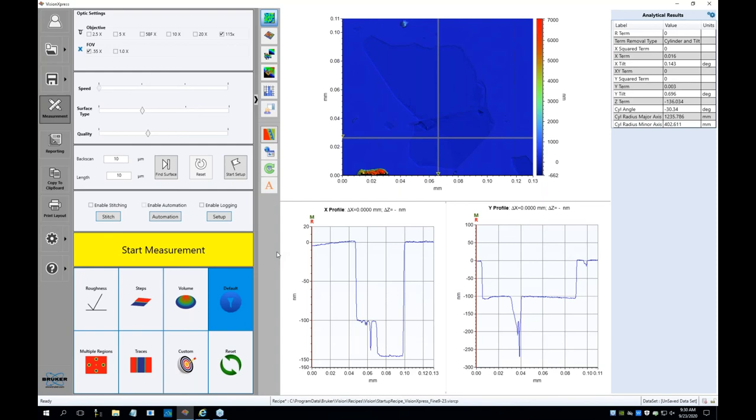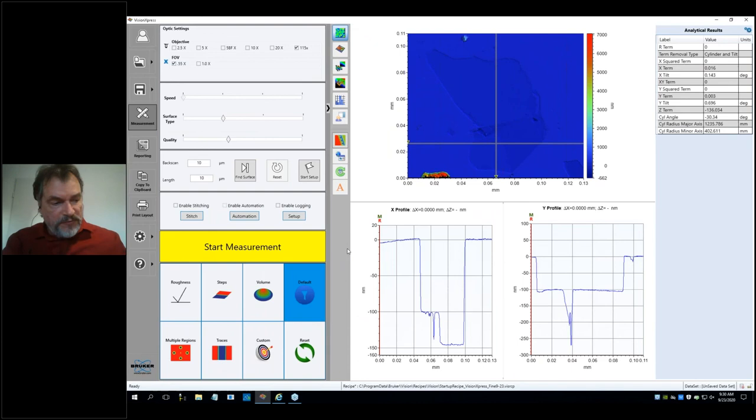Right. We have fiducials on the sample holder. We use these for the data reduction that we're doing, to subtract one measurement from the other. We do that through our own software, which also uses the reference surface that we're using. We do that a bit differently.